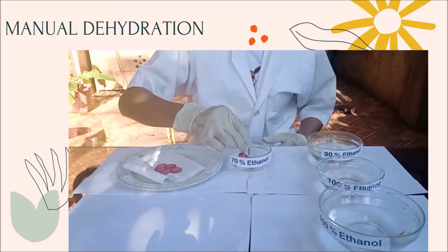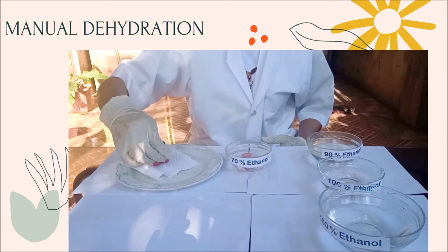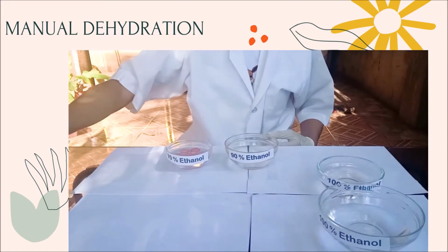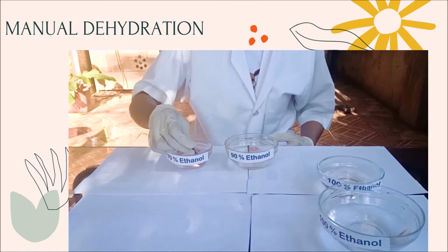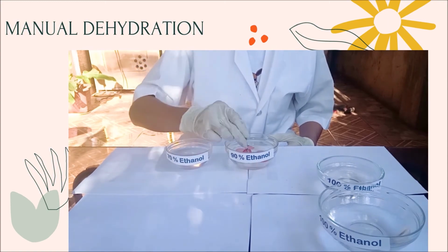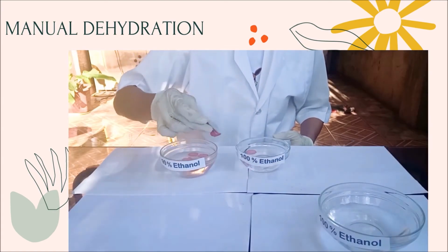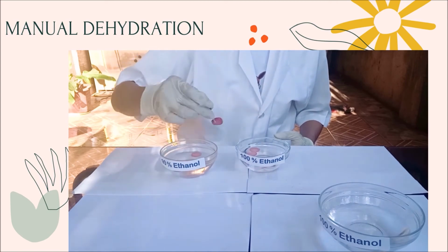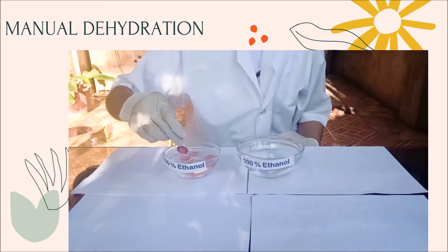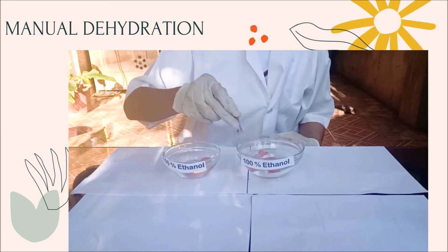First, immerse your specimen in 70% ethanol and leave it for 15 minutes. After 15 minutes, transfer it to a higher concentration grade of ethanol, which is 90%, and leave it for 15 minutes. After that, place your sample in a higher concentration grade, which is 100%, and leave it for another 15 minutes. With the same process, place your sample in 100% ethanol and leave it for another 15 minutes.